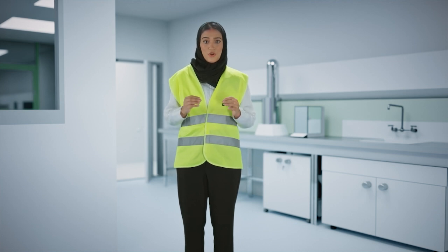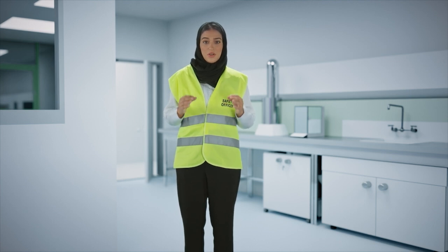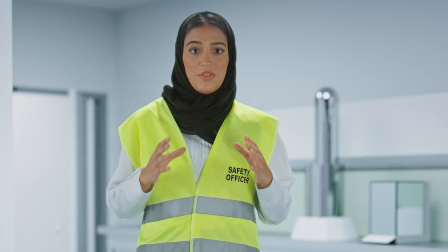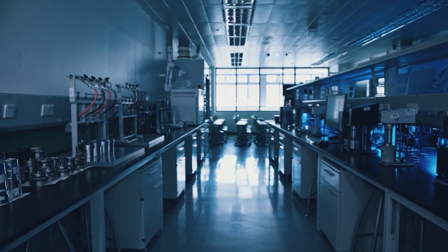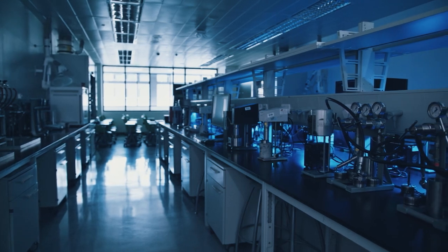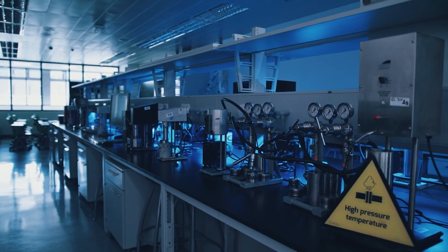However, your instructor may be momentarily away, working with another student, or farther away from the incident, and you must respond quickly. While preparing to respond to an emergency, remember that the primary goal is to protect human life and minimize injury. Never put yourself in danger. In laboratories, the most common emergencies that you may need to respond to involve fires, spills, cuts and burns.